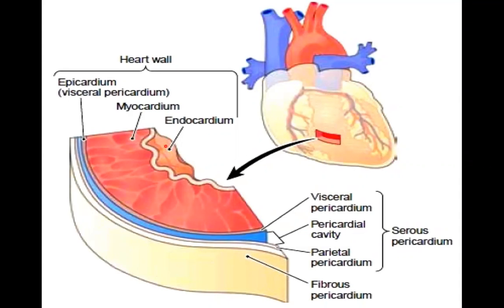If we come to describe the endocardium, the lining epithelium of it is of simple squamous endothelium. While of the epicardium, the lining epithelium of it is of simple squamous mesothelium. Always the epithelium which is towards a lumen, we describe it as endothelium, while the epithelium which is outside to a cavity is described as a mesothelium. Also, the middle myocardial, the thickest layer, consists of the cardiac cells.